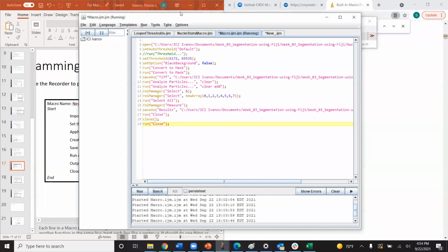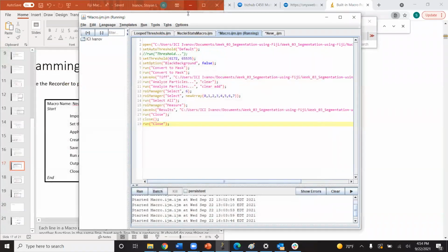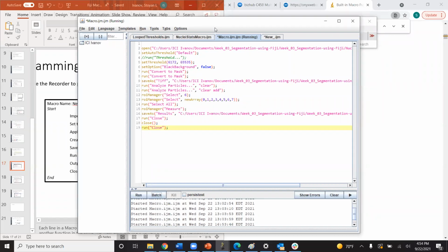When ImageJ saves a file, it wants to write a new file with the same name. If a file is open, such as this one, which is still open in Excel, it prevents ImageJ from starting that process. So it throws an error and it interrupts the macro. So when you are managing your input/output, keep that in mind.